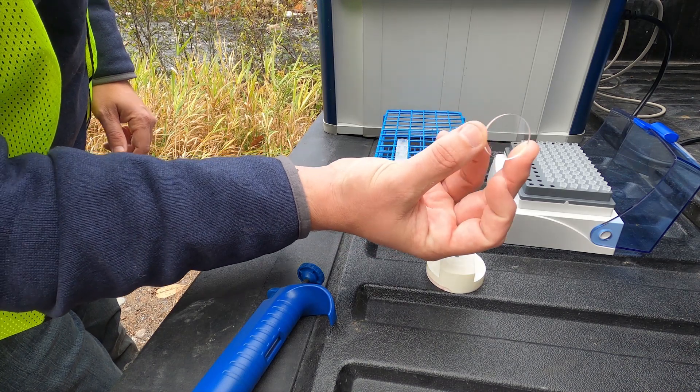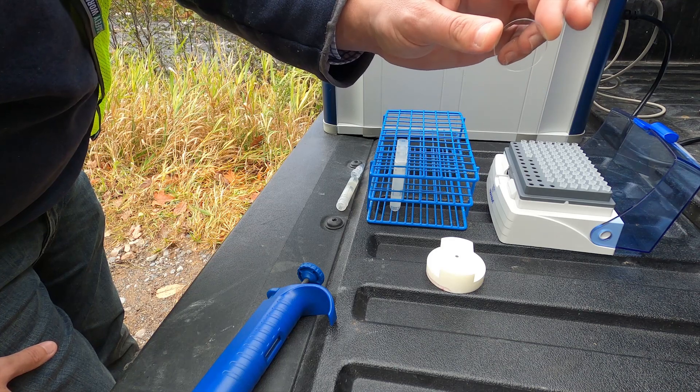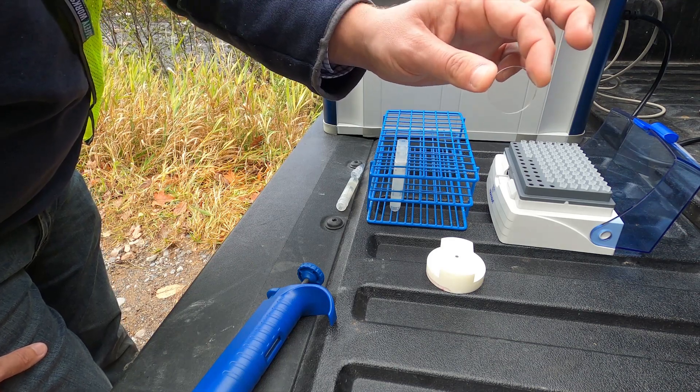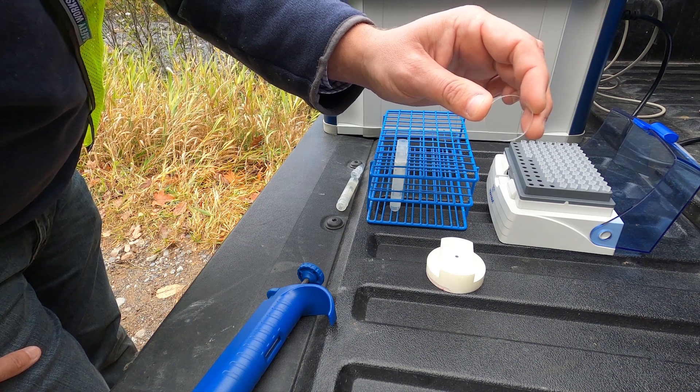Here we see a dried sample on that disc. In essence, it's very difficult to see any sample or residue, as it has dried as a thin layer onto that disc.